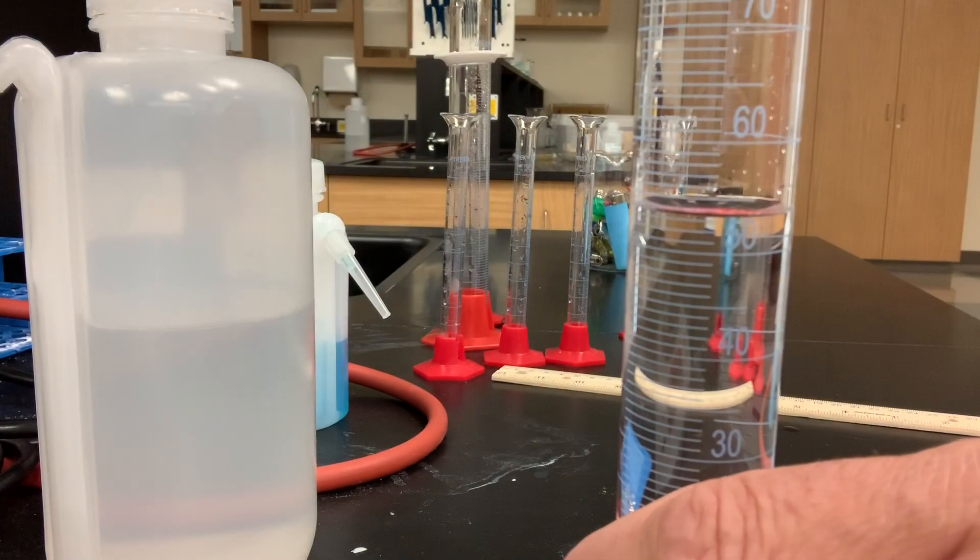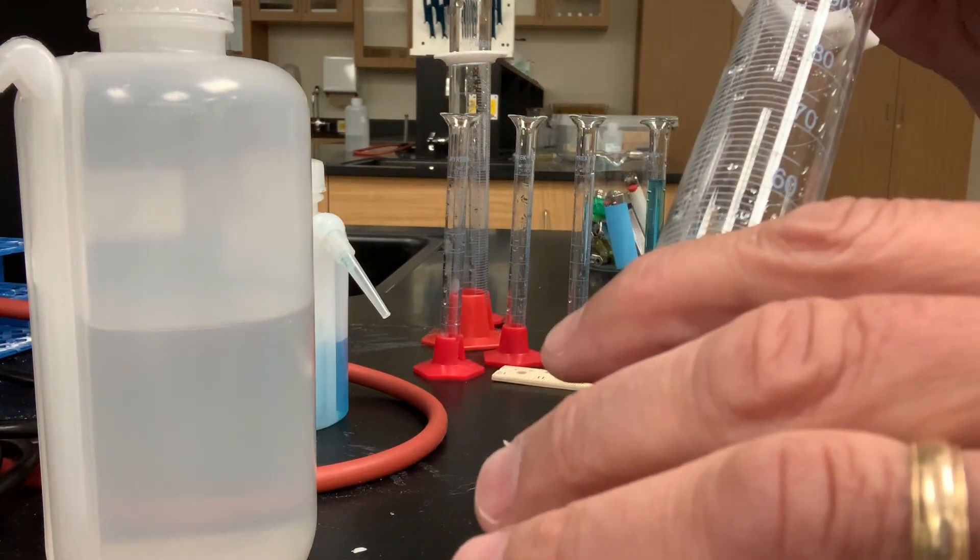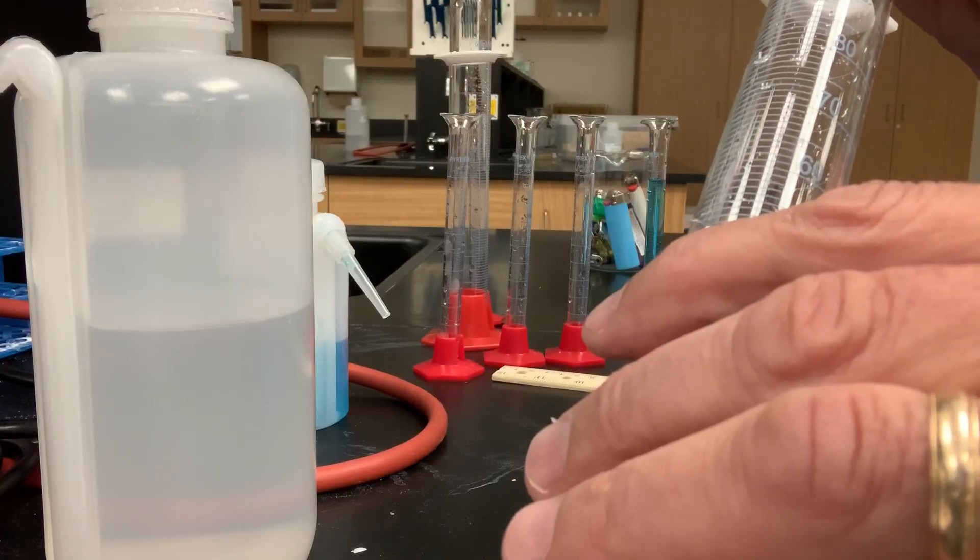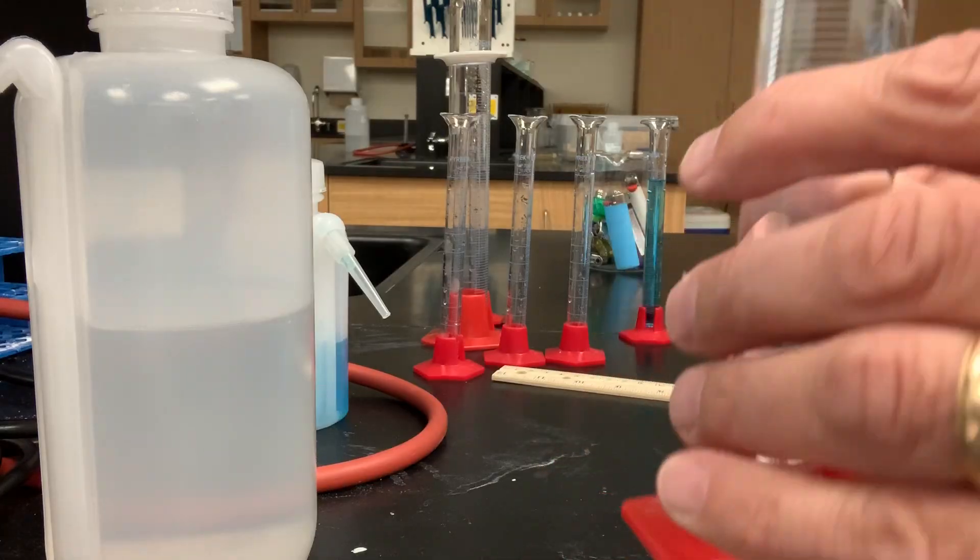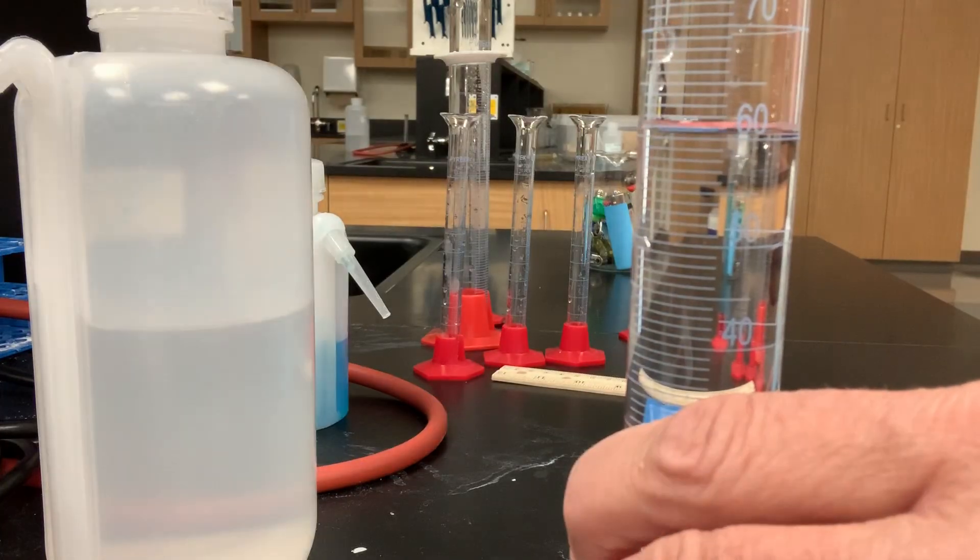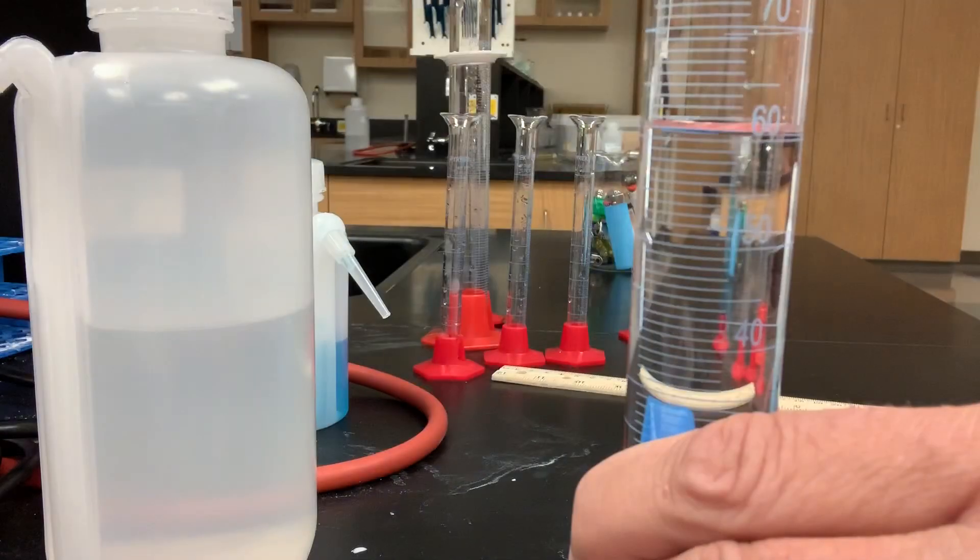All right. Let's add my glass beads. And I want to do that at an angle so I don't splash that water out. And we'll add all six because didn't we find the mass of six? So, we better add all six to find the volume of all six. Okay. We've been added. Oh, I'll be darned. The water level went up. That shouldn't be a surprise. Let's go ahead and take a final volume measurement with the glass beads inside the graduated cylinder. Looks like it's a little bit above 60.